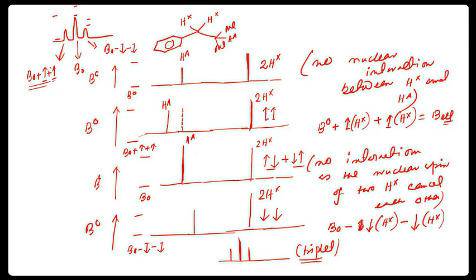If somebody again asks, can you tell us some more? Yes. This is for the peak where the nearby two protons do not have any interaction. Exactly, this peak is from the splitting for the same B0 value. That's the beauty of triplet splitting. I hope you clearly understand the triplet splitting and doublet splitting.